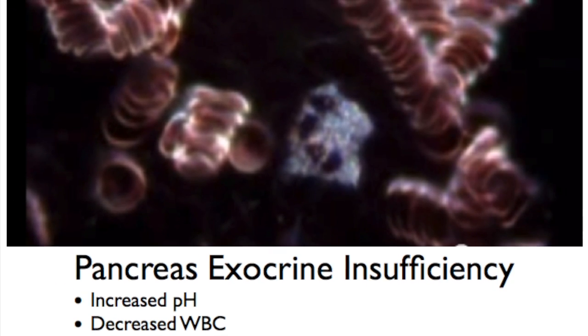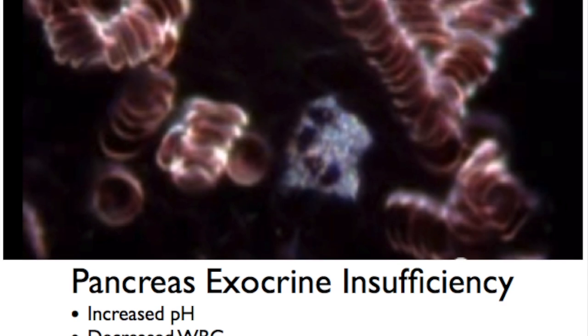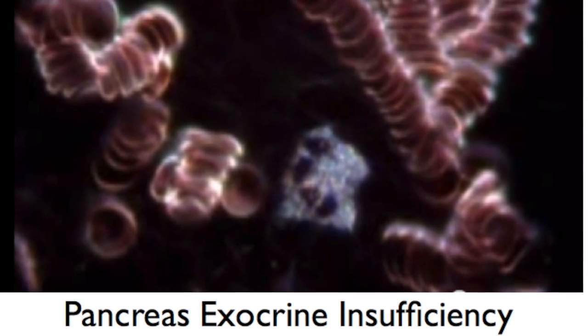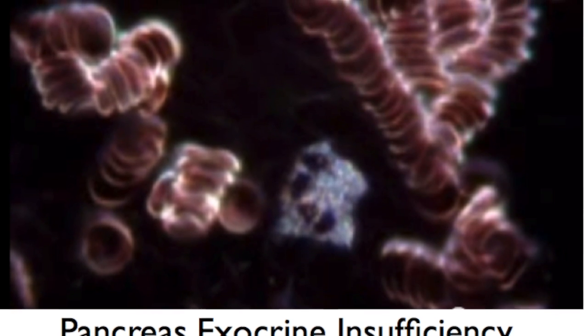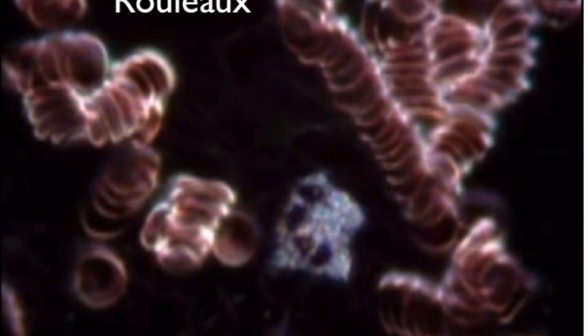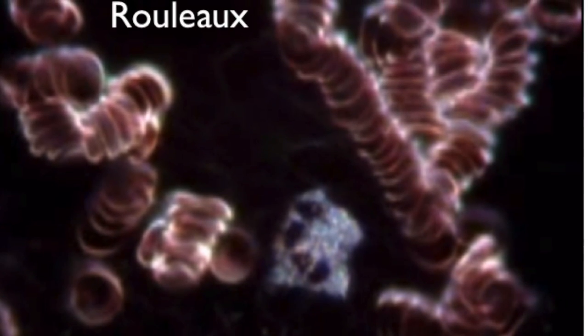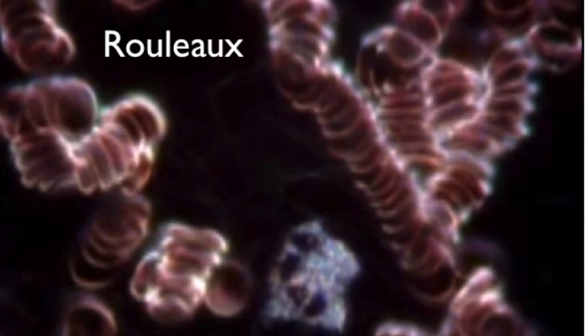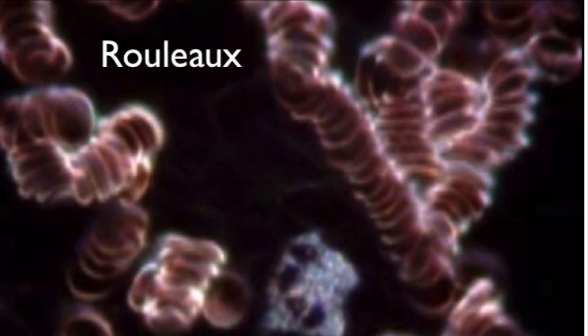These red cells are stuck together, which means that there is a series of consequences ranging from a shift in the pH and zeta potential, free radical damage, microbial endotoxins, and altered hemopoiesis. The electrostatic charges bringing them together, and that the proteins are very sticky, make them difficult to break apart.